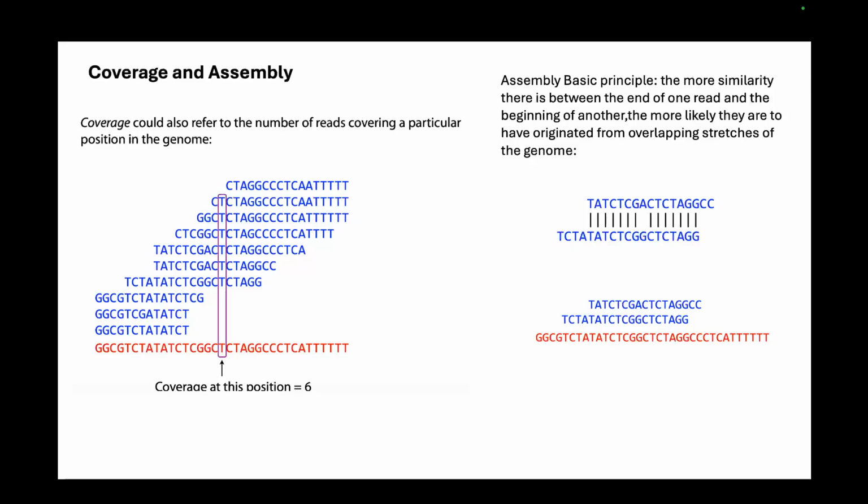Now, building the reference genome requires building it from scratch. You don't have any other genome to fall back on, so you need to design your reference genome from scratch. How do we do that? That is the concept of genome assembly. Basically, you have very short reads, from sequencers like Illumina or Nanopore. Nanopore is slightly longer, but technically, in the context of the whole human genome, you have very short reads. Now you need to assemble these reads one after another and get the whole genome.